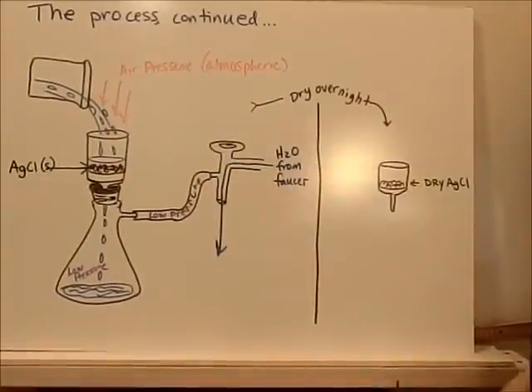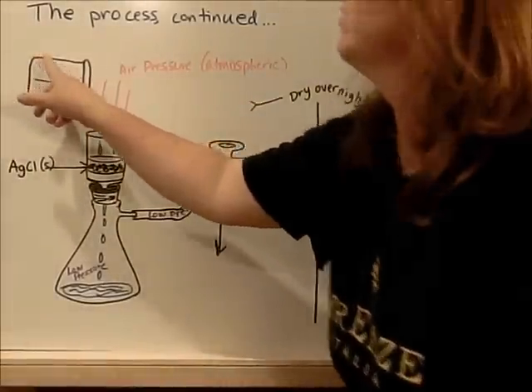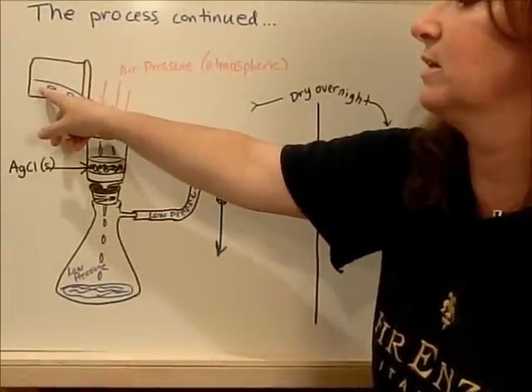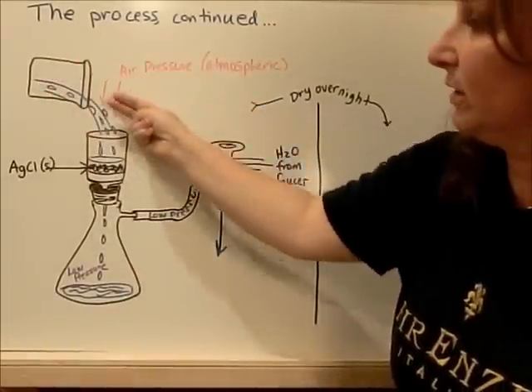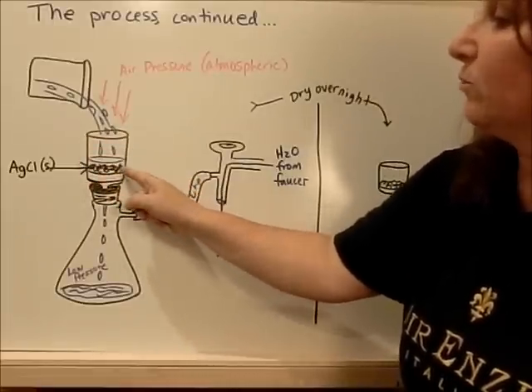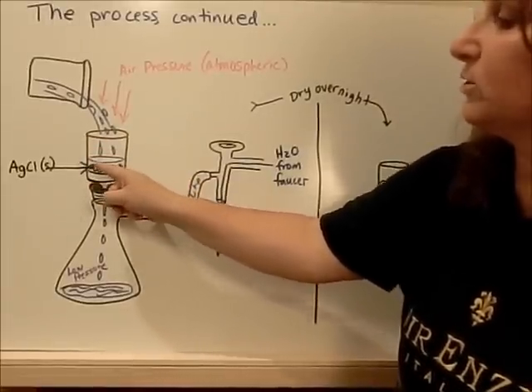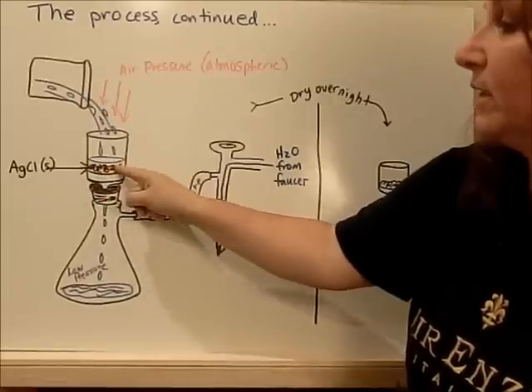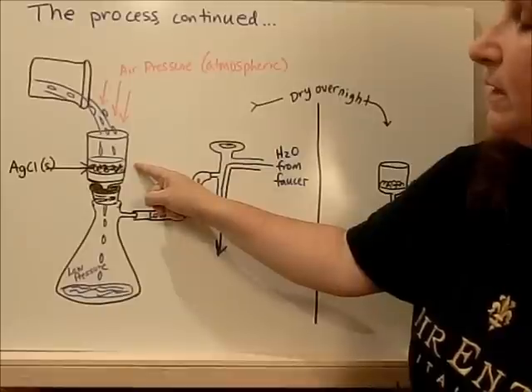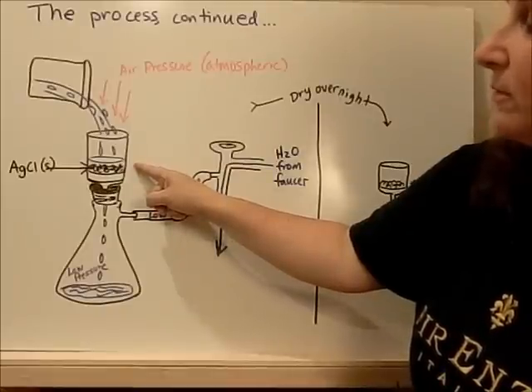Okay, this is the process continued. So once you have your beaker, and it had the copper still dissolved, but the silver and the chloride is a solid. You literally pour it through this fancy funnel called a Gooch crucible. And what I've drawn here is that your silver chloride, which will actually be white, not black, will be kind of chunked into a solution of copper, still dissolved in water.